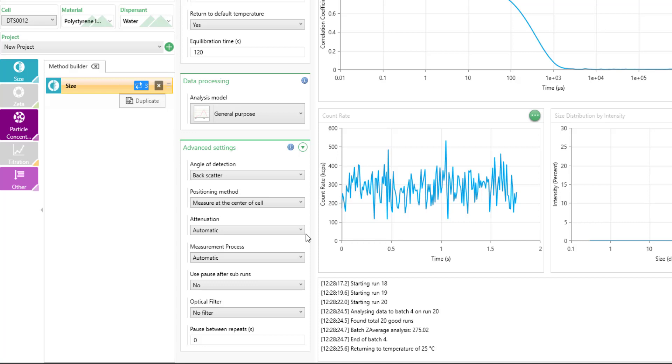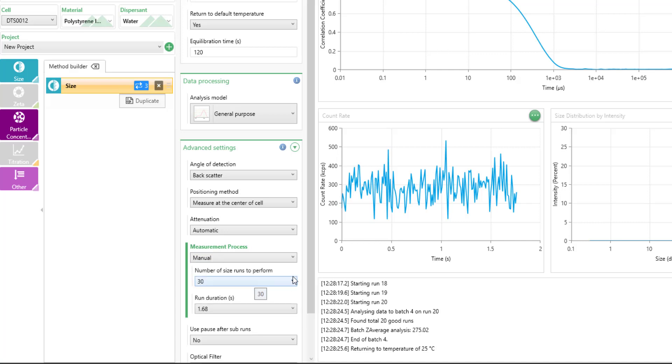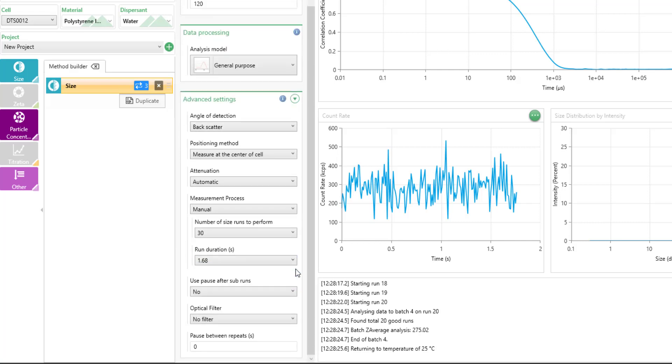The measurement process, it's generally set to automatic, but can be fixed down to a manual process. If you've already found the optimal measurement conditions using the automatic settings, you can simply lock these down to manual.